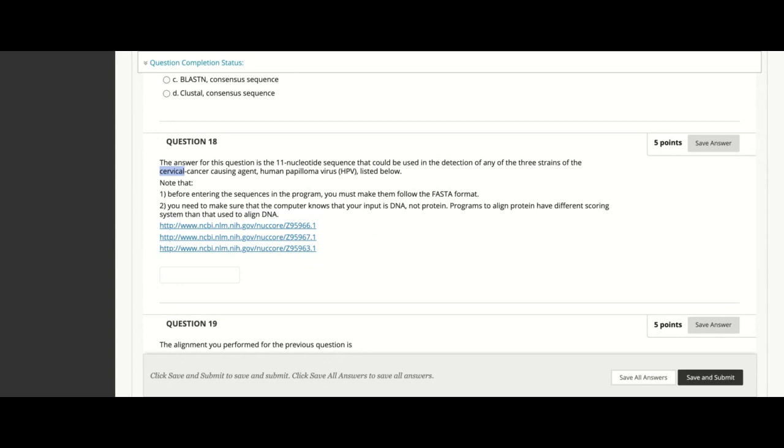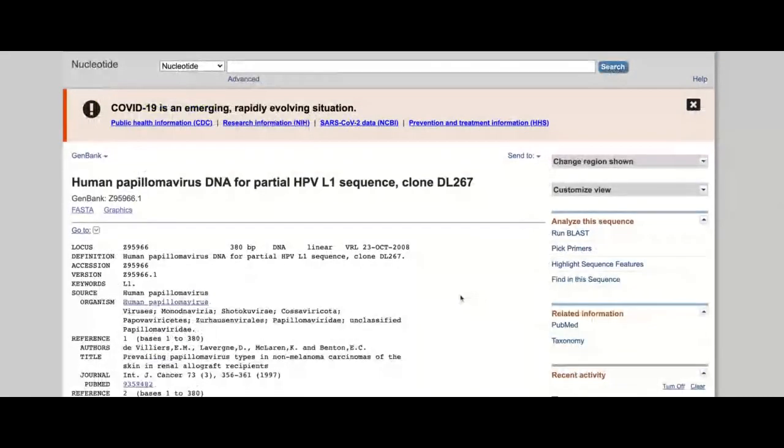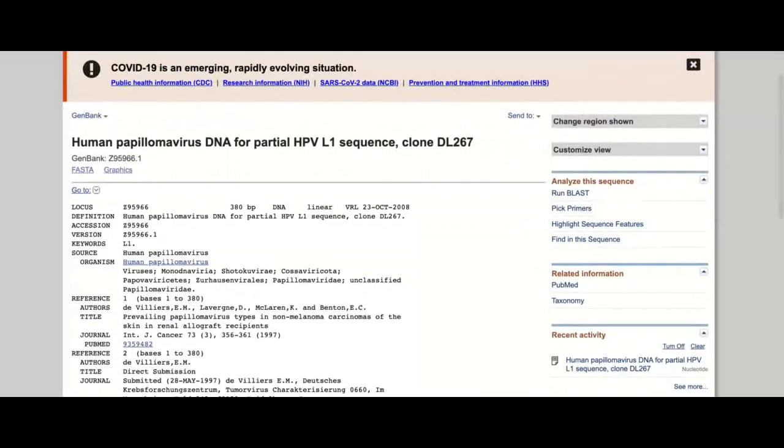I'm going to do this, but every time I open a new tab, I have to share a different screen. But let me show you what the records look like, because this is also so useful. It's stuff that exists that you didn't know exists, but it's paid with your tax dollars. So that's kind of nice to see, the use of your money in a way that is beneficial and that, I don't know, feels very, very palpable to me.